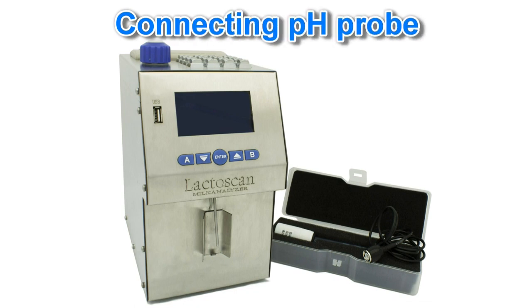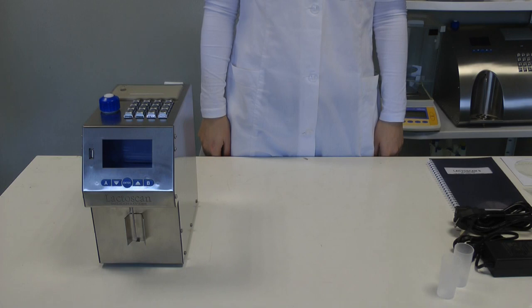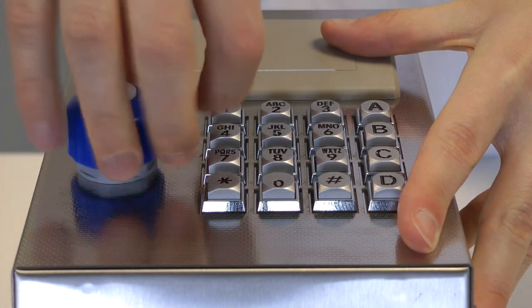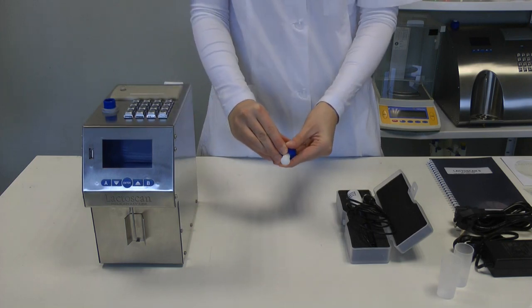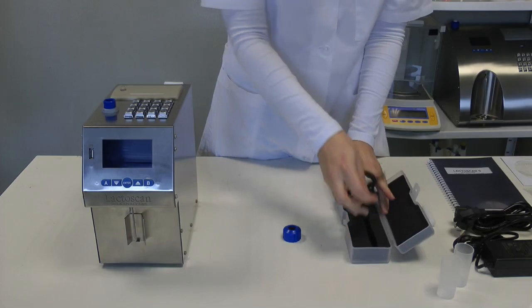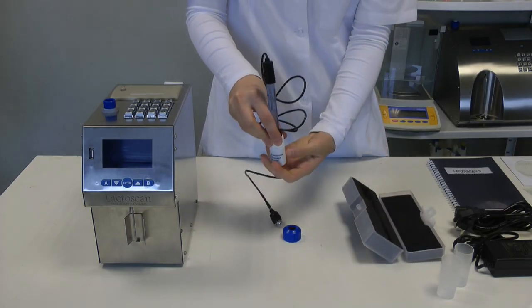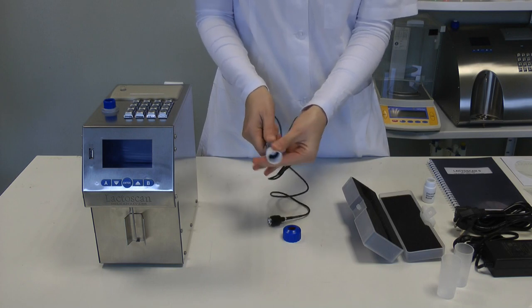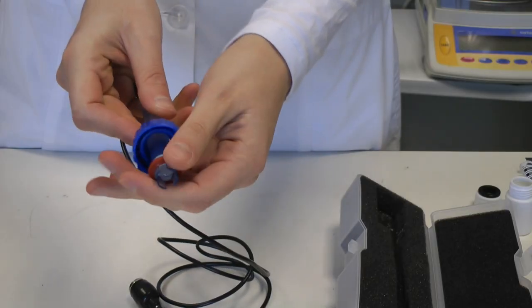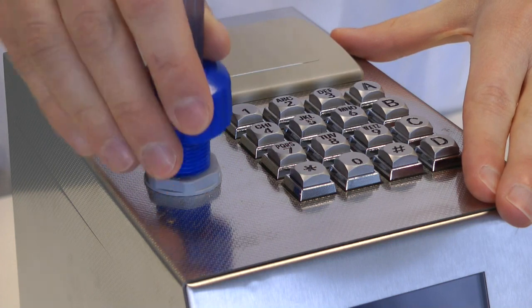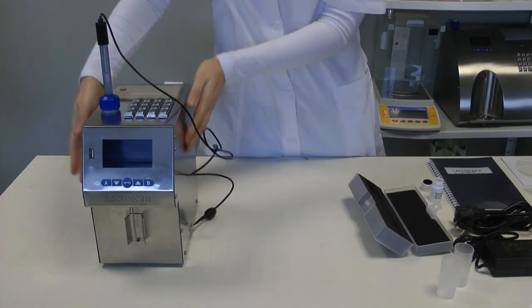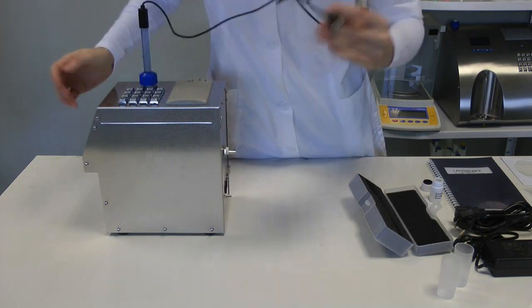If the analyzer you've ordered is with pH option, connect the probe before connecting the analyzer to the electrical network. During transportation, the pH probe is packed separately. To prepare it for work, unscrew the fixing nut turning it counterclockwise. Remove the cap. Carefully put the pH probe. Pay attention not to damage the gasket or ring. Put the probe with the gasket and screw it. It is very important to tighten the fixing nut tightly. Pay attention that no air enters the system. Connect the pH probe to the connector.